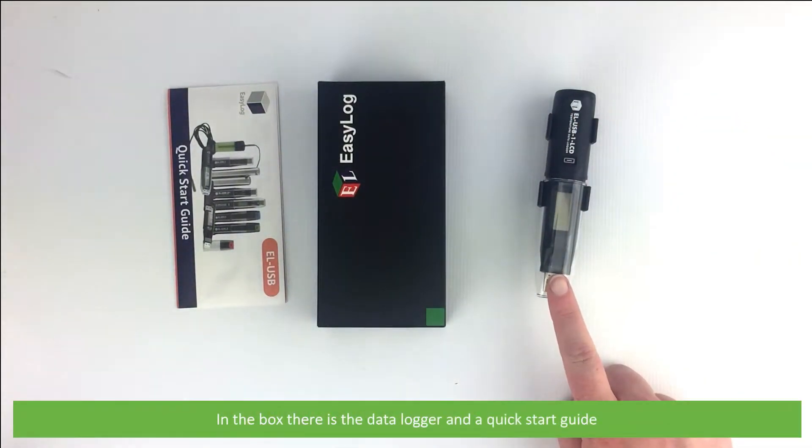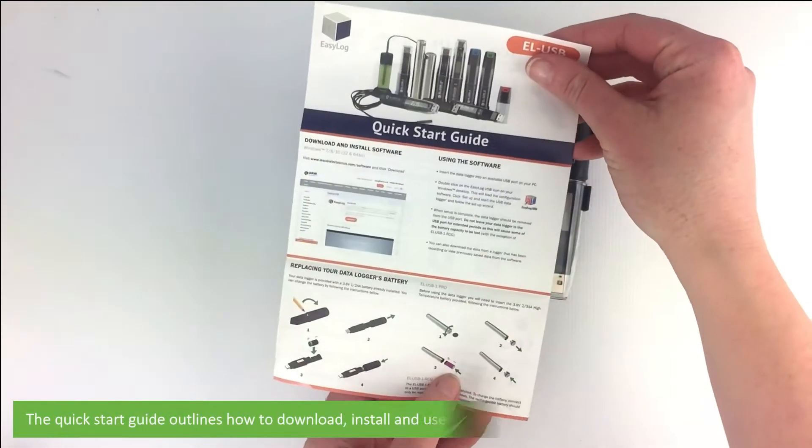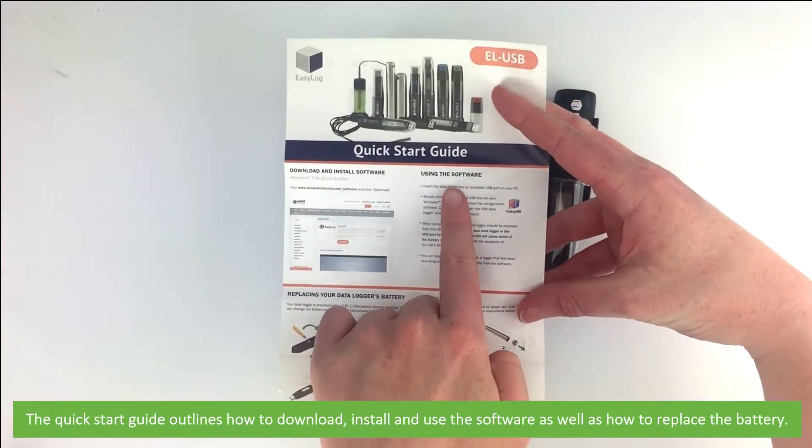In the box there is a data logger and a quick start guide. The quick start guide outlines how to download, install and use the software, as well as how to replace the battery.